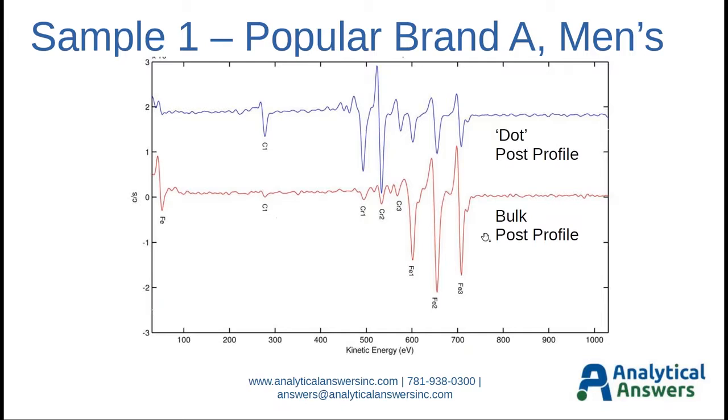And if we compare a scan of the bulk stainless steel, which looks similar to the scan I showed you before, where you have 3 iron peaks that are very large, a couple of small chromium peaks. If we look at the blue, which shows one of those little polka dots, we see that there's much less iron present and a very, very strong chromium and carbon signature. So those are little chrome carbide rich inclusions that help the mechanical properties of the materials.